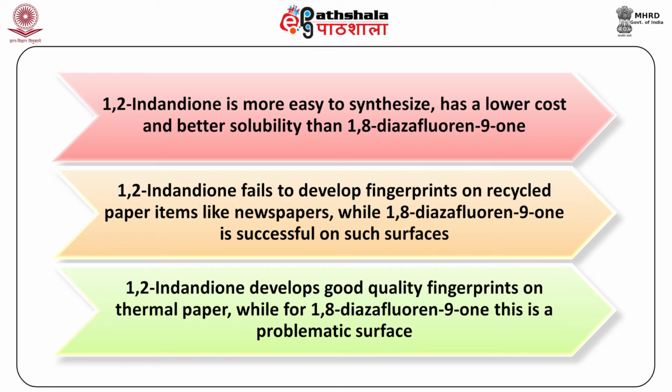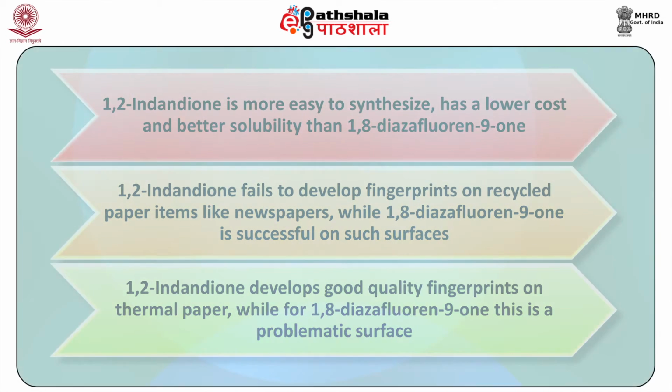1,2-indandione fails to develop fingerprints on recycled paper items like newspaper, while 1,8-diazafluorenone is successful on such surfaces. 1,2-indandione develops good quality fingerprints on thermal paper, while for 1,8-diazafluorenone this is a problematic surface.